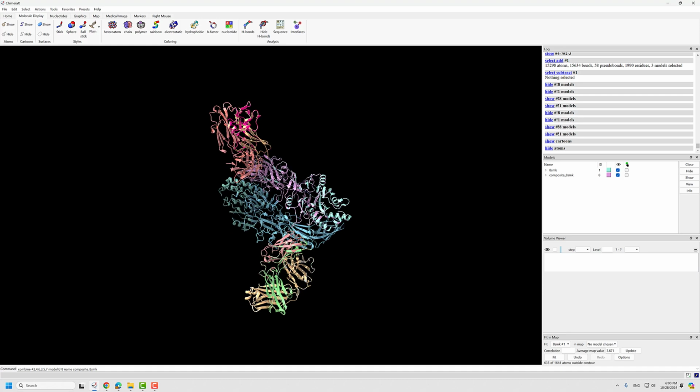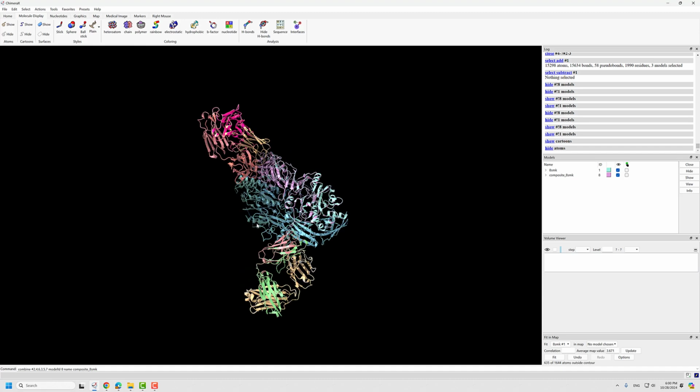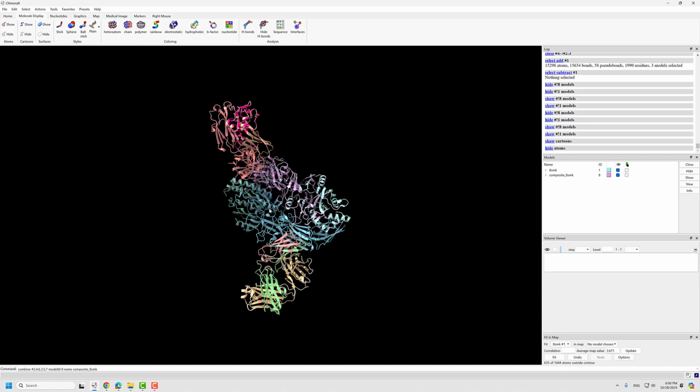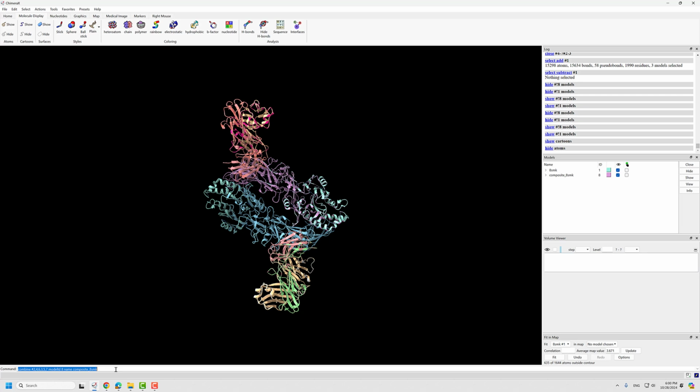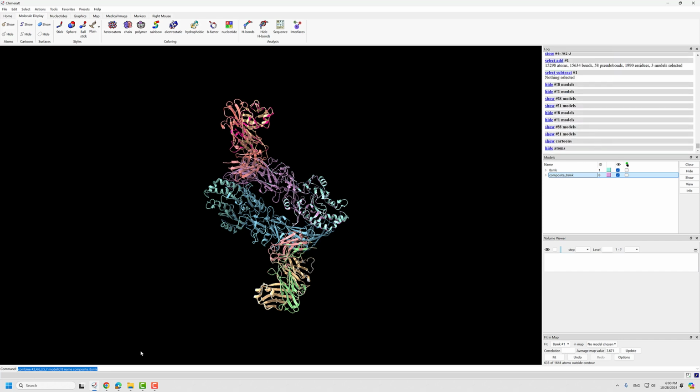It looks like I didn't get the order correct, because if it's correct, the color might be the same, or I might be wrong.